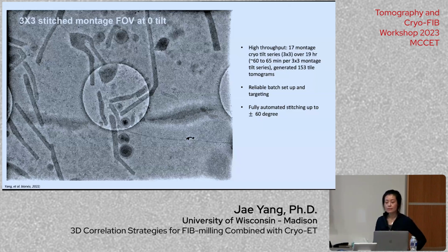Can I ask a follow-up question? In that case, after you have the subtomograms aligned in these tiled tomograms, can you put them back in the big montage tomograms? It's actually a very good question. You should be able to, because you will have the coordinates file, and then you will have the coordinate shifts. I haven't tried it, but it's a very good question. Yeah, that would be nice if you do it and then apply it back into the big montage. But there are some shifts to apply during the correlation while you're tile stitching. So, yeah, it will be beautiful if you have it. Yeah, that would be great.